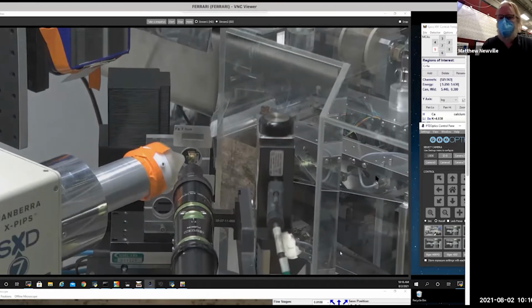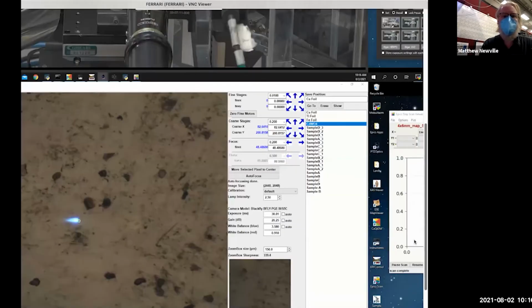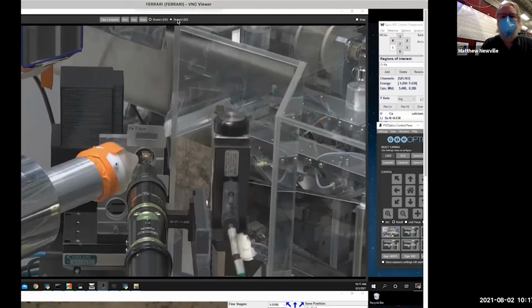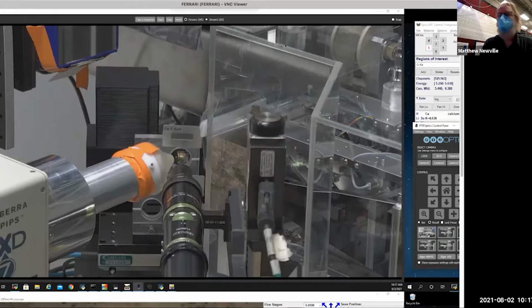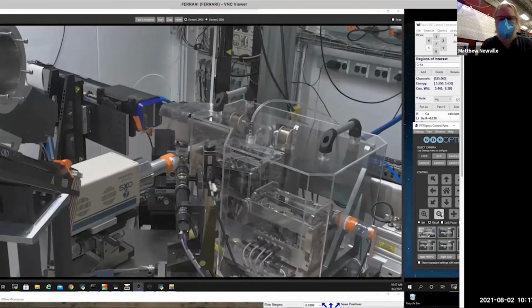In fact, if I go down in what I'm sharing, down here, that's an image of the microscope view of that same sample. So here we have the microscope. In fact, if I zoom out a little more, you can see the full microscope, an objective lens on a tube, and a camera back here. And that's the other view we're seeing. So we have this big view of the hutch, and then a 1 millimeter field of view focusing in on the sample position.